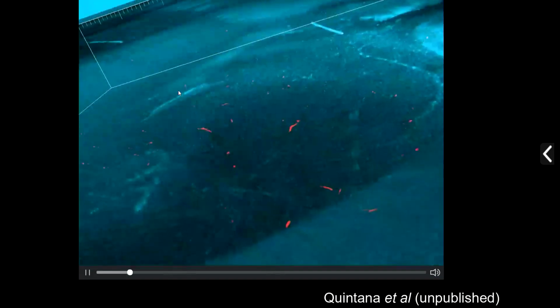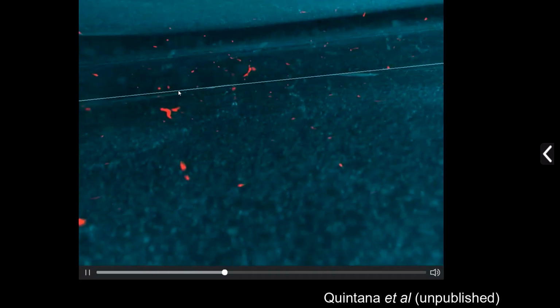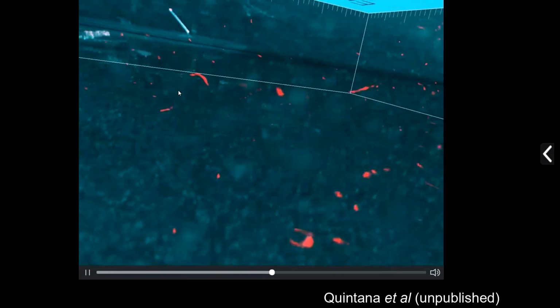Now, the researcher posed the question, how do the parasites cross the blood-brain barrier? And their hypothesis was that they come up through the brain stem. So we were able to use the Mesolens, and these red blobs are the trypanosomes, to understand if there were any clustering phenomena taking place. Turns out there's not, so it's not coming up through the brainstem.